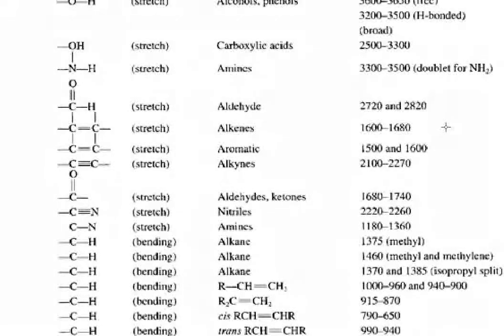Next we come in the table to the CC double bond stretch of alkenes, and related to that is the CC stretch of an aromatic compound.